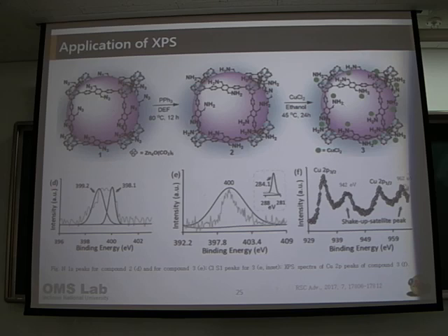And a very important piece of information we can discuss from this peak, that means the right side peak. Each peak shows the copper 2p 3/2 and copper 2p 1/2. This is the orbital splitting. So in this case, the copper type of peak, copper 2p 3/2, means this is the copper chloride. That means copper 2, not copper 1.